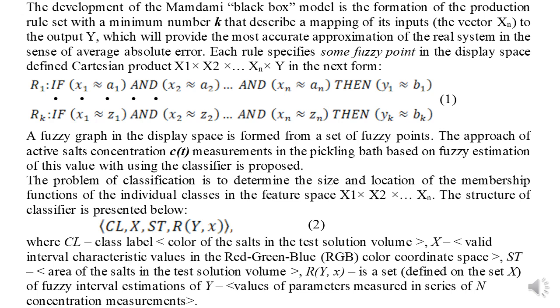Re x is a set defined of the set x of fuzzy interval estimation of y values of parameters measured in the series of n concentration measurements.